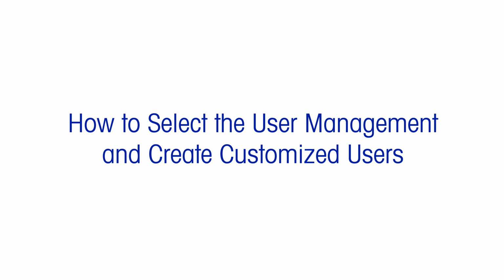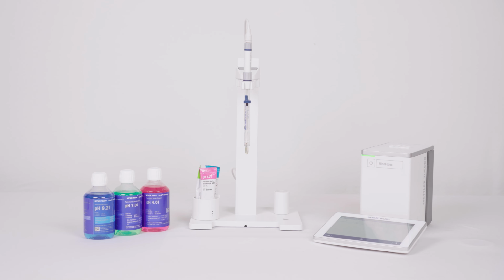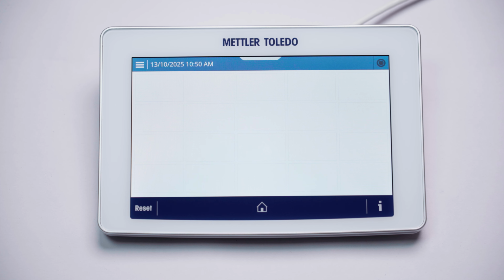How to select the user management and create customized users. User management. Welcome to our guide on the user management. Let's get started with the basics. Look at the detachable terminal.